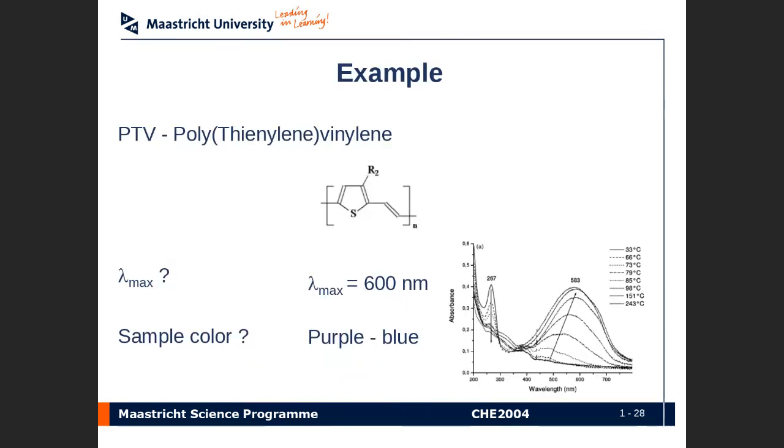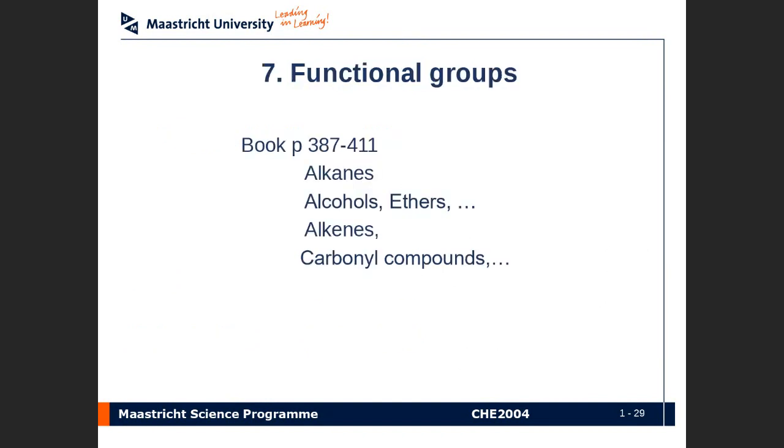So this is just another example of a nice compound that has a beautiful color, right? I don't think I'm really going to discuss that. That kind of more or less brings us to the end of the lecture. We've looked now at a brief overview of UV-Vis instrumentation, what it means, what it corresponds to.